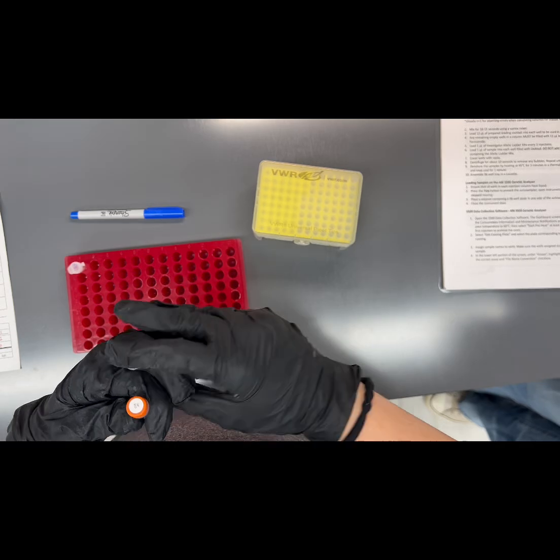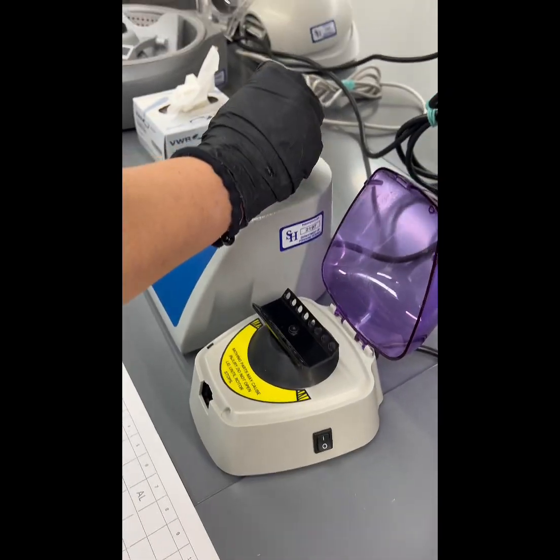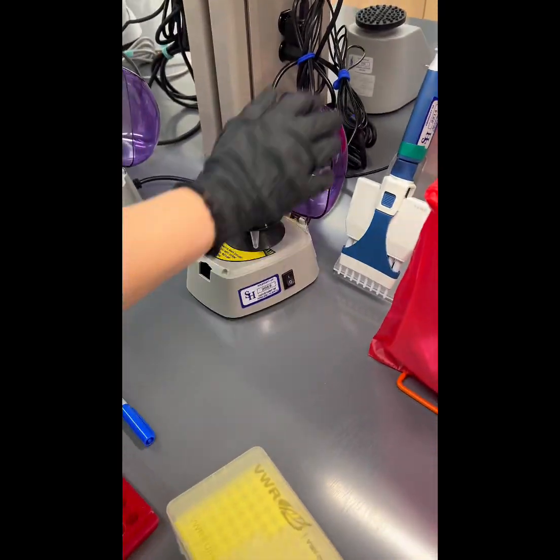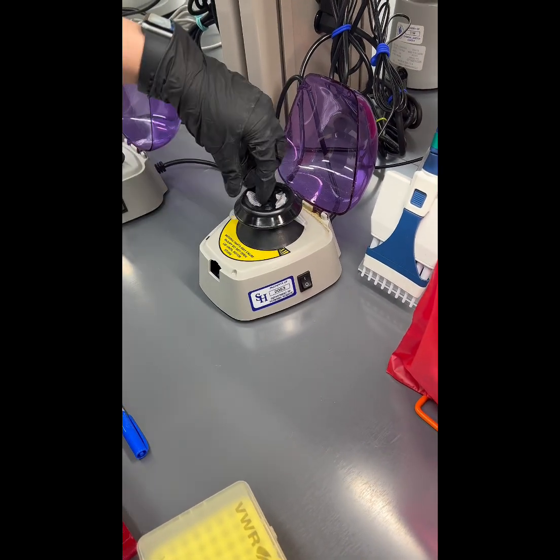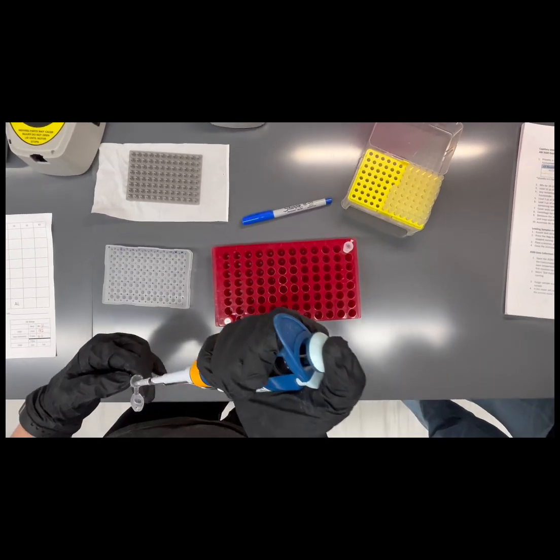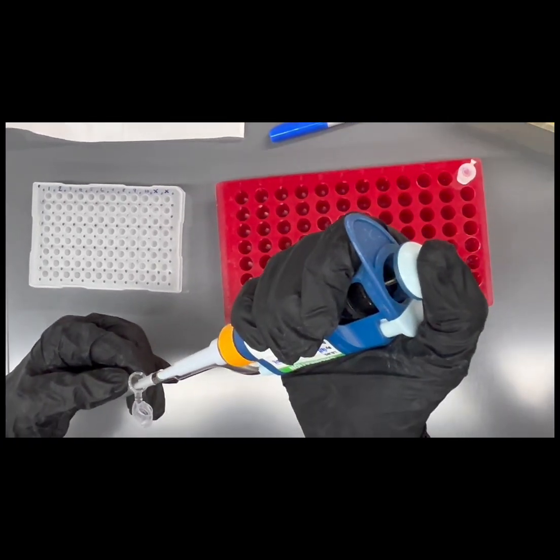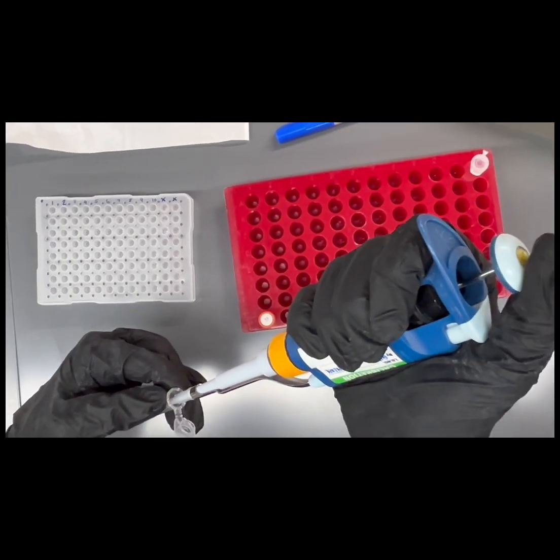The internal lane standard, labeled with a different dye from the target DNA fragments, co-migrates with the target STR fragments through the capillary. The internal lane standard's fragments of known sizes are used to compare migration times and determine the sizes of the target STR fragments. The dye channels allow the DNA fragments to separate by color, and they are detected in the order they reach the detection window. When setting up the CE plate, an allelic ladder mix is added every 3 injections.